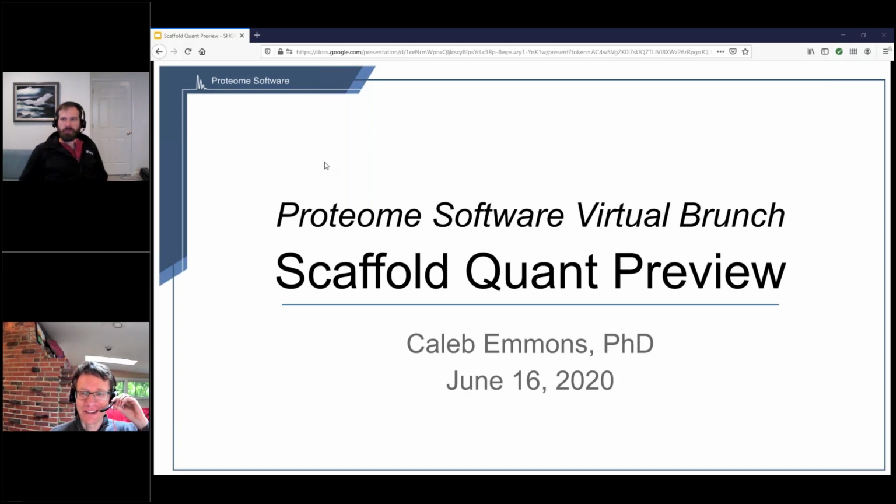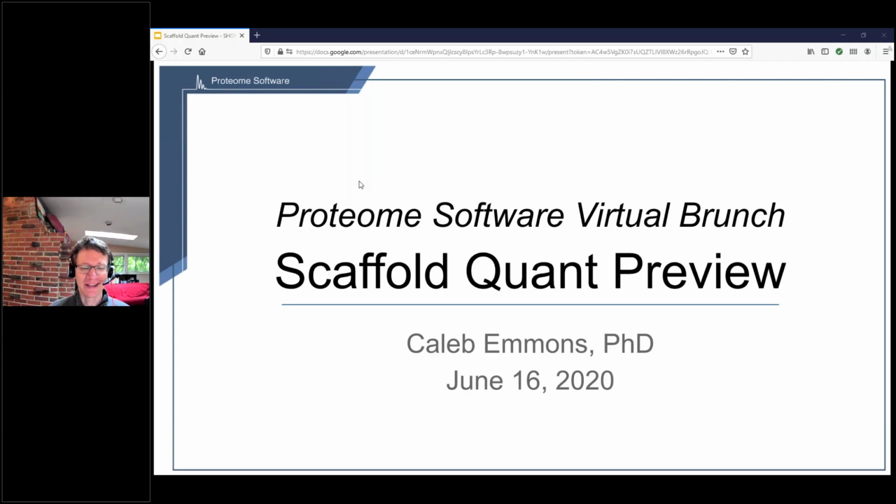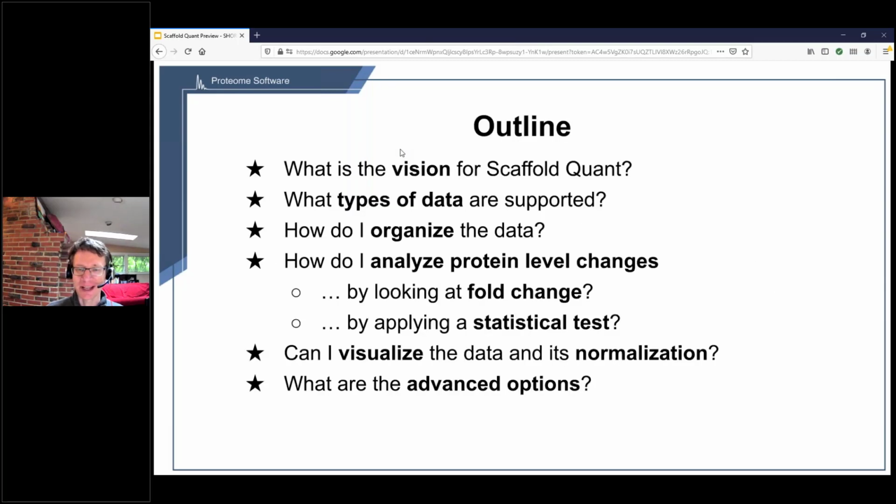Okay, thank you, Jacob and Susan, and I'm glad everybody could make it to our virtual brunch, although it's too bad we can't meet in person. So as they mentioned, I'm going to be giving a demo here of Scaffold Quant, something we've been working really hard on, and hopefully will soon be coming out so you guys can all enjoy it.